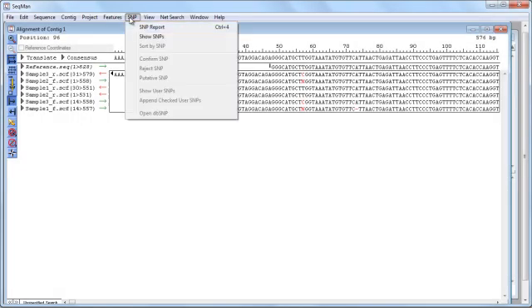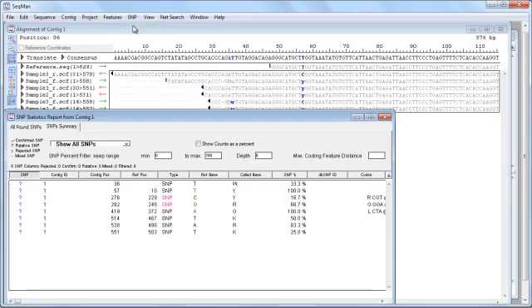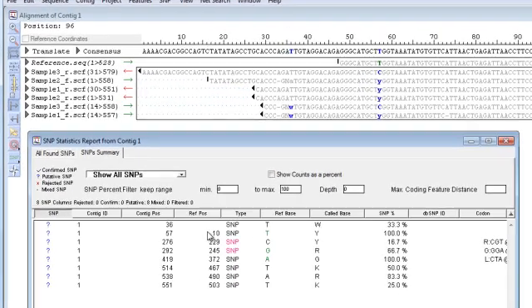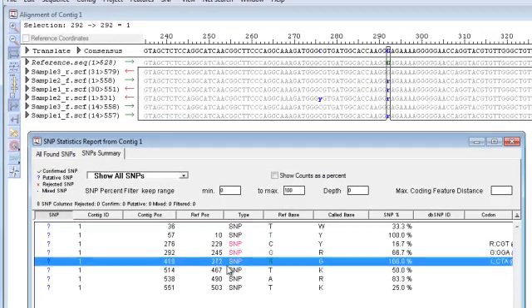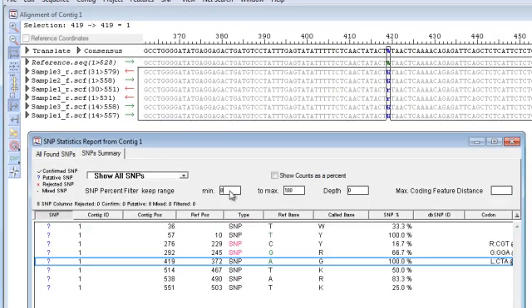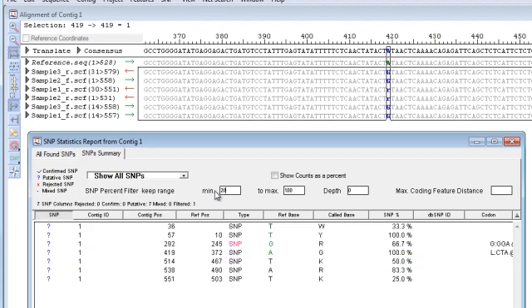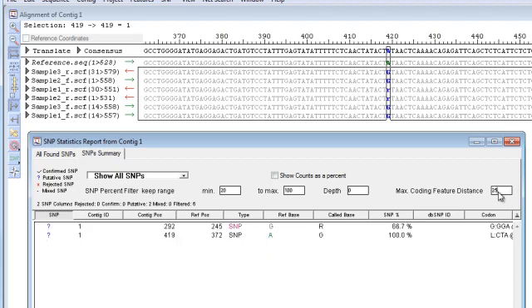The interactive SNP report allows you to easily navigate putative SNPs in your assembly. You can also filter this report based on SNP percentage, depth of coverage, and distance to the nearest coding feature.